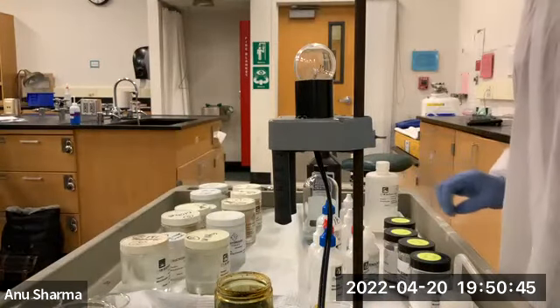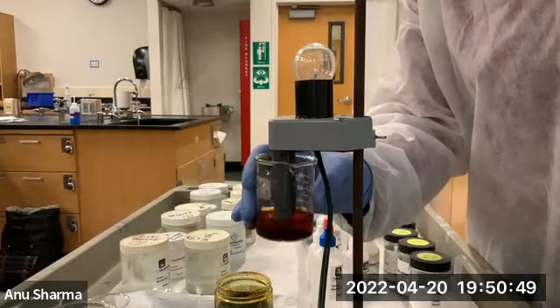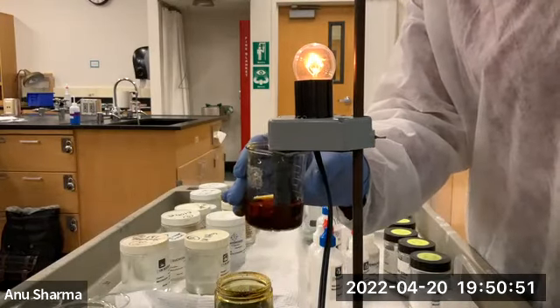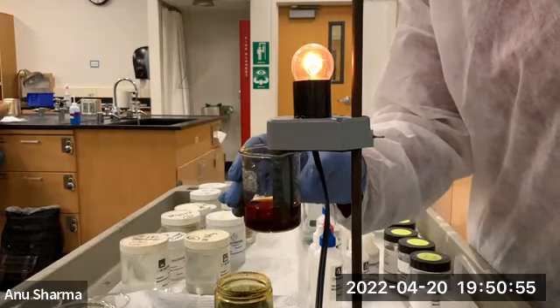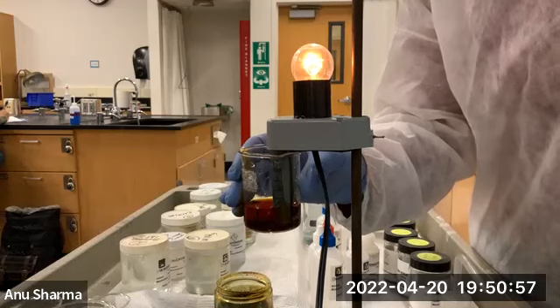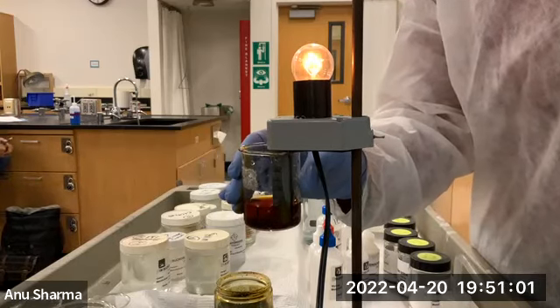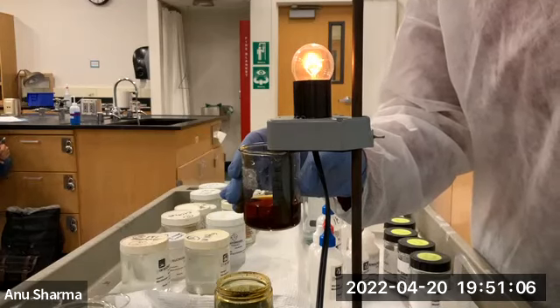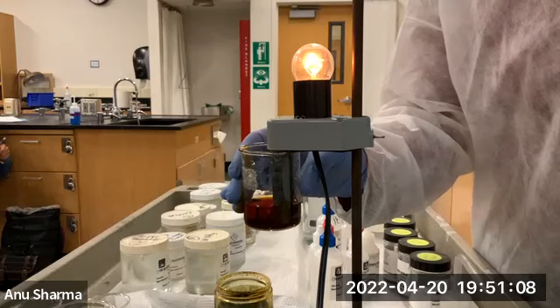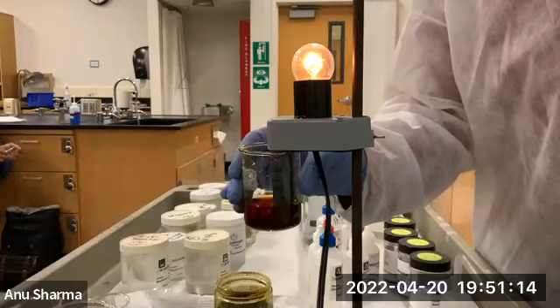All right, so that's one piece. Now let's see if it is going to conduct electricity. Whoa, right now it is conducting electricity also, look at that. So what I'm thinking is that it is breaking up into hydrogen ions and iodide ions. Iodine is reacting with water and producing hydrogen iodide, which is like hydroiodic acid.